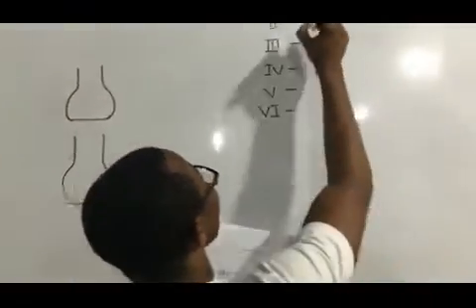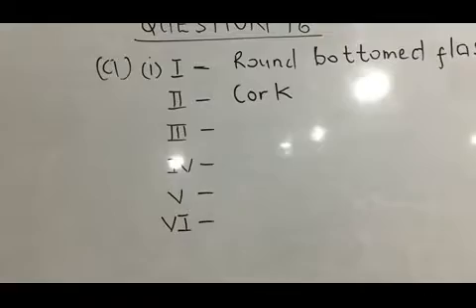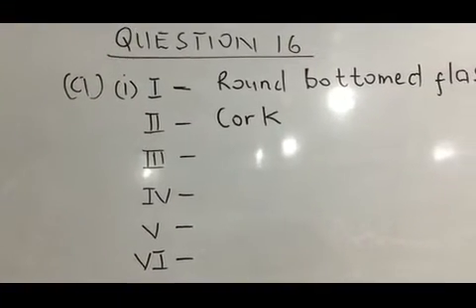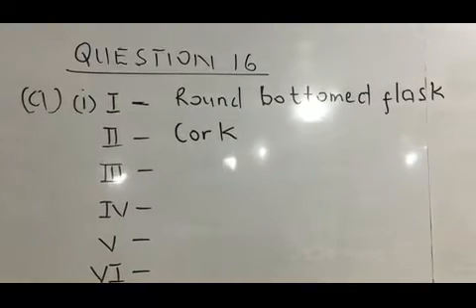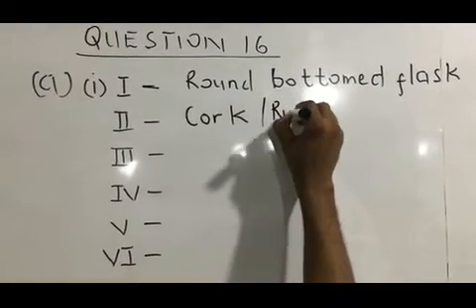And then your II is the cork. I told you your cork is the same as the stopper. It's also the same as the rubber bung. It's the same thing.